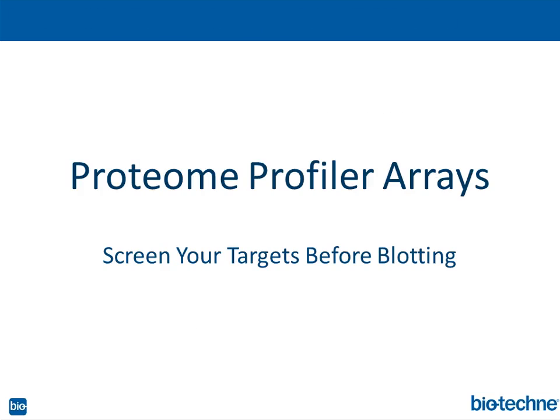Okay, I want to end the webinar, if you will, with a few things that I think are directly related to what we're talking about here. As we just got done discussing, Western blotting is not a trivial technique. It's a necessary technique, there's no doubt about it. But my gosh, it could take days, perhaps, to do a Western blot. And at the end of the day, you might not get data. The reality is sometimes things don't work out.